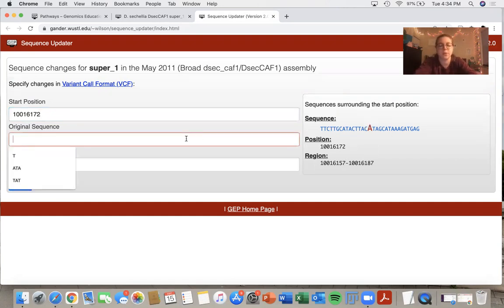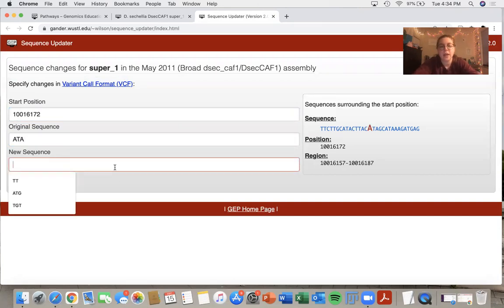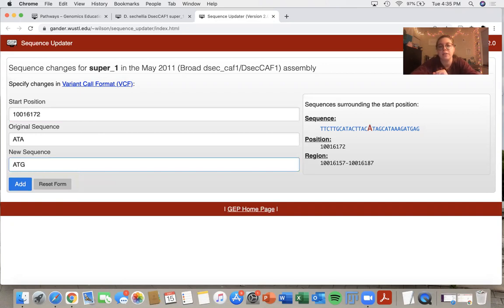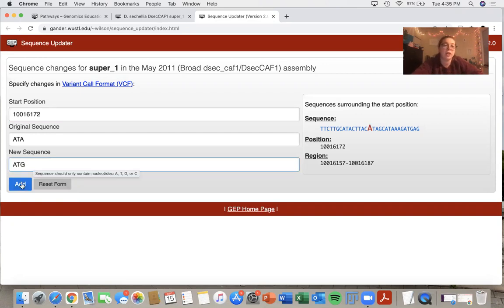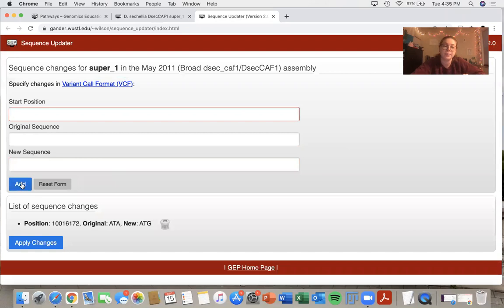So the original sequence I know is A, T, A. And say that I thought that the sequence should actually be A, T, G based on other lines of reasoning. So then I would type in my new sequence A, T, G and click add.